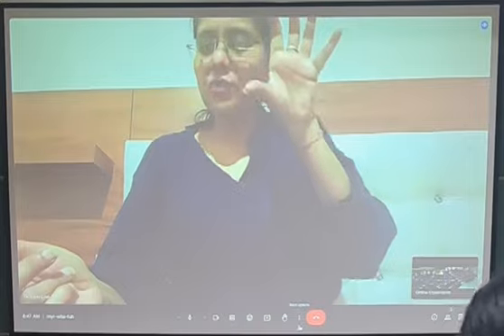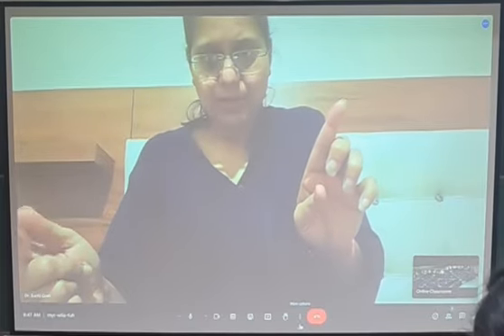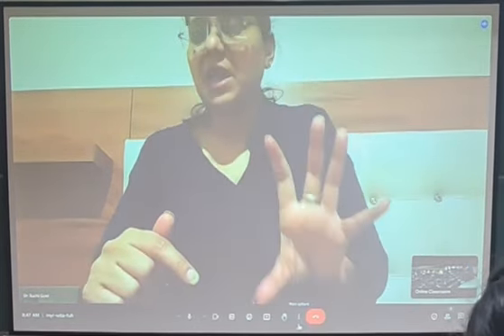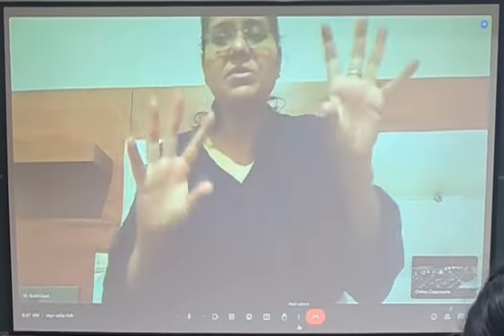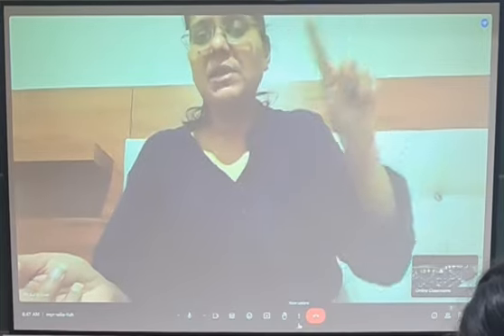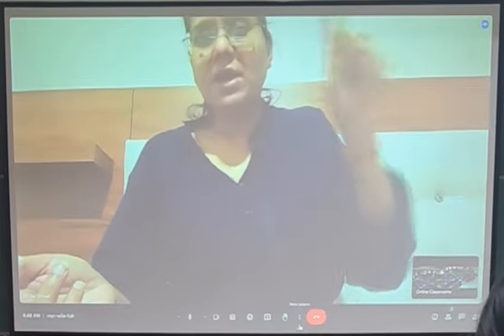Okay, so what you do is you have to count the bacterial cell. You should know the bacterial cell in each square, but you count multiple squares and then take an average. Instead of just counting one square with 3 lines, I count multiple squares so that I can make an average. So there is no problem there. If my sample is not homogeneous, I can still get an average number. So if I have counted 4 squares, I have 100 bacterial cells, for example, I will do 100 by 4. If I count all 25 squares, 100 by 25. If I count only 2 squares, 100 by 2.